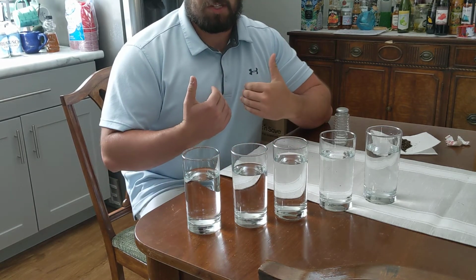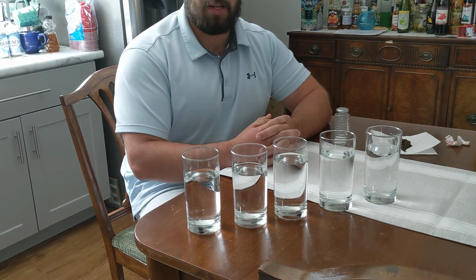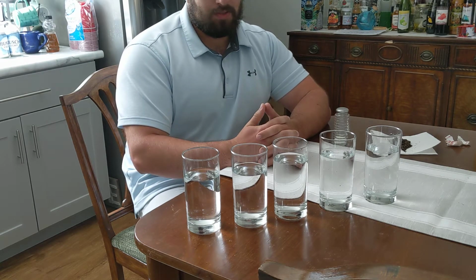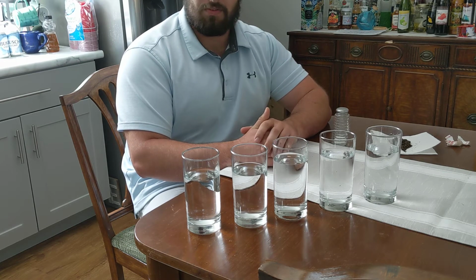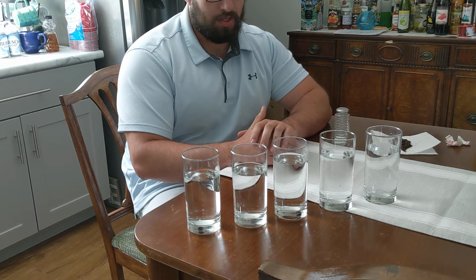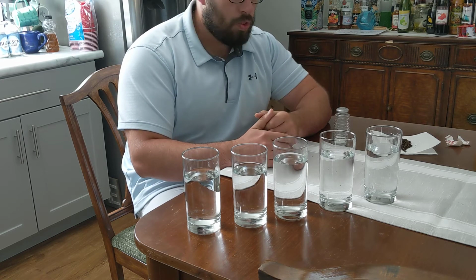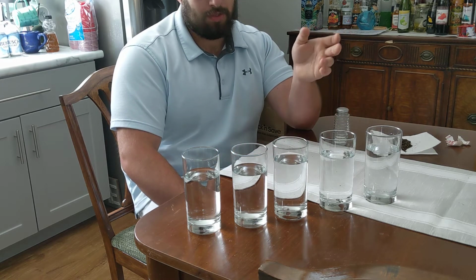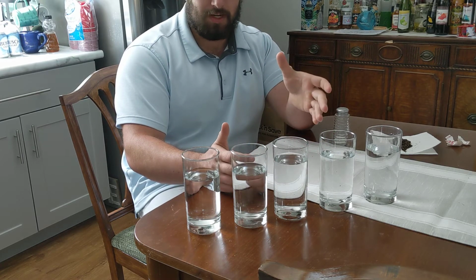Anywho, my name is James Nikolaou, and I am doing a short lab, very very short lab, on water pollution for my Bio 170 class at UW Superior. Water pollution on a very simple scale means stuff in the water that really shouldn't be in the water, and can be harmful for natural environments or creatures' health or human health. So, we have a couple waters lined out here, and I'm going to put some pollutants in several of these so we can kind of see what it looks like.